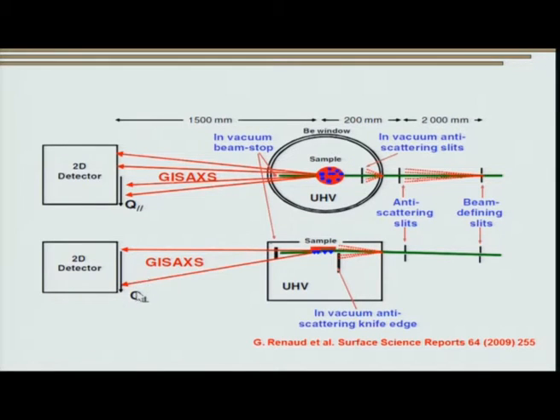This is where you will get your specular pattern and your Yoneda peak. Again, I am mentioning time and again that these are all exaggerated figures; all this is happening at a nanoscopic level, and this angle is very small, and that is the reason why we keep this distance very large, so that we are able to see some difference.